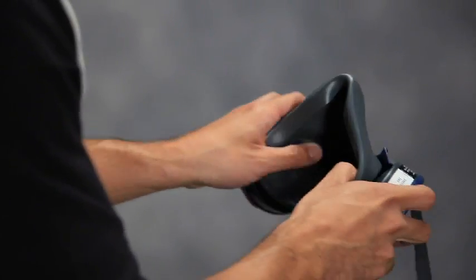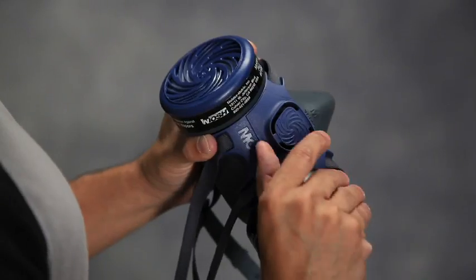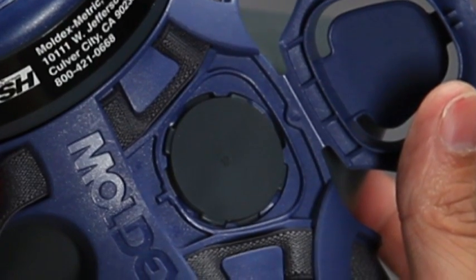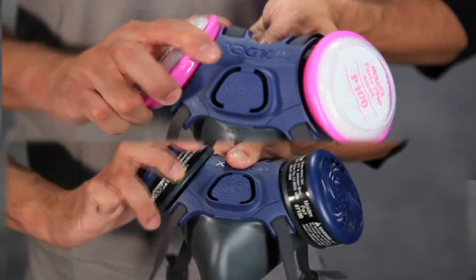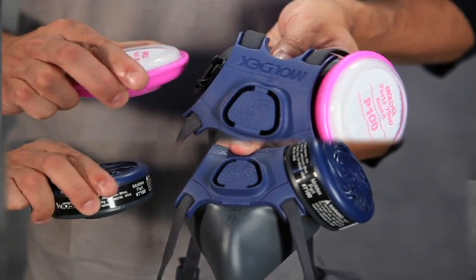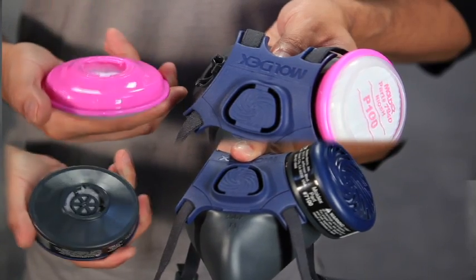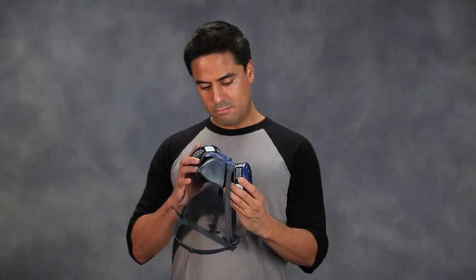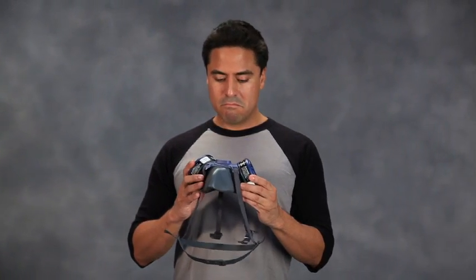Also return to your supervisor if inhalation or exhalation diaphragms are missing, torn, damaged, or not properly seated; cartridges and or particulate filters are at the end of their service life, cracked, damaged, or not properly seated; or any other plastic part is cracked, distorted, or damaged.